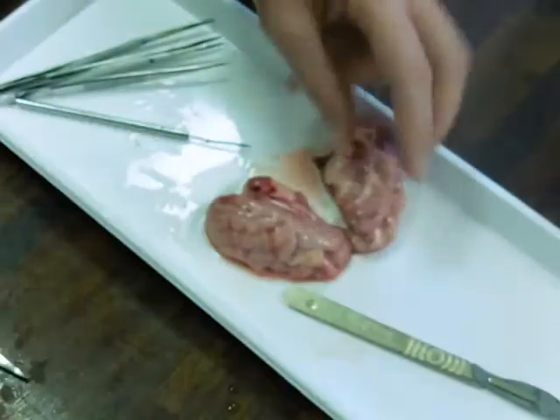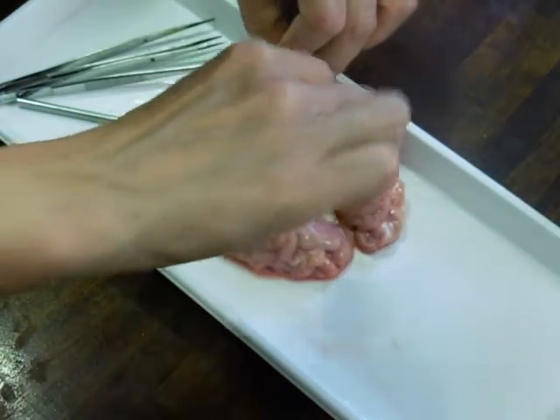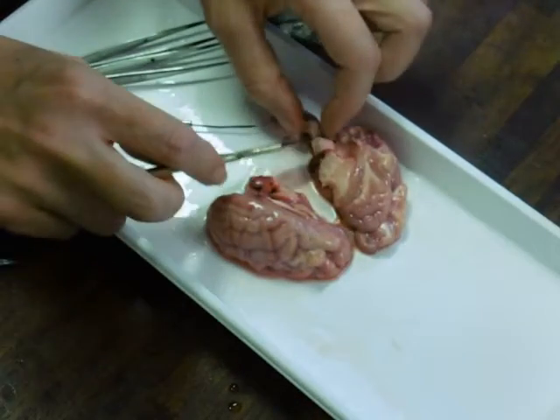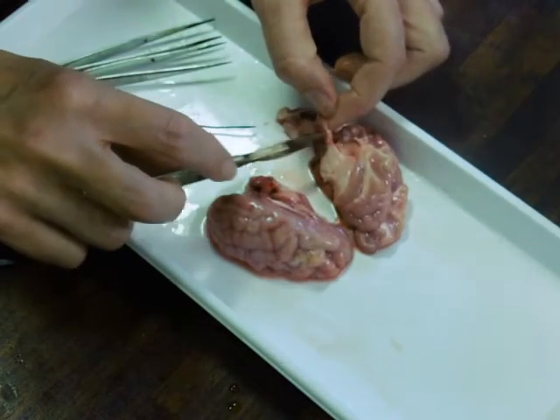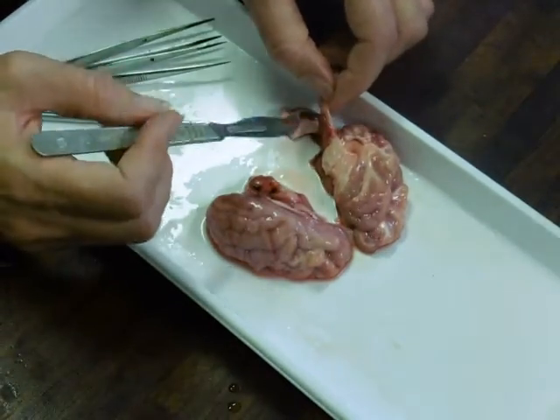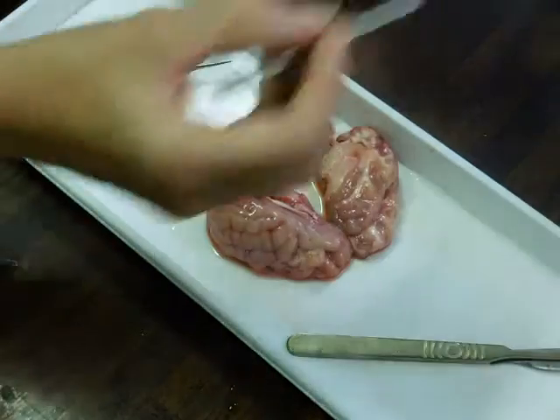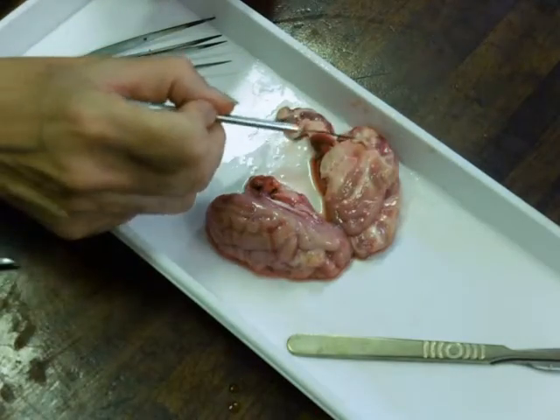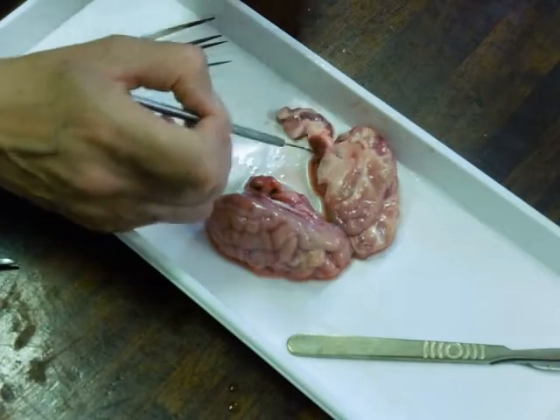Cut that bit off there, I think that bit's... But you have that in the brain. I thought it was all muscle. The brain? Yeah. No. See, I could tell you anything now, but because it's going on YouTube, someone else somewhere might see it and go, that's a load of rubbish. Because I could go, oh yeah, that's obviously the pituitary gland, like I knew what I was talking about. But I'm thinking that bit there, that's making that arc. Yeah, but look how it goes up into the cortex.